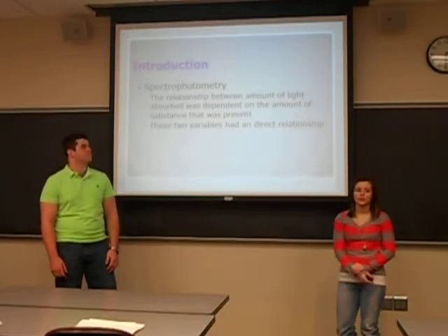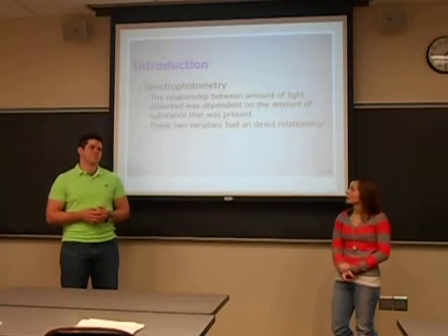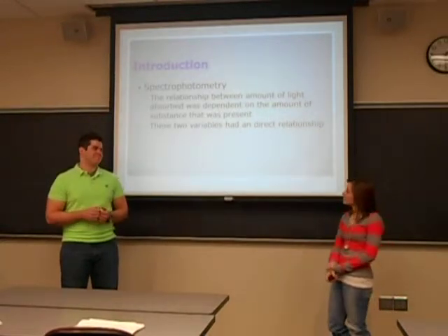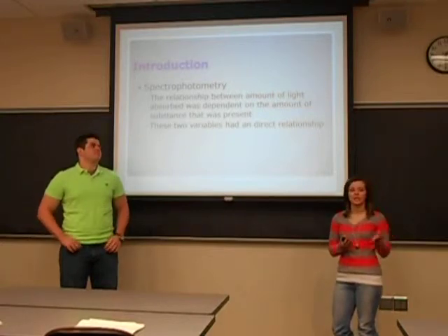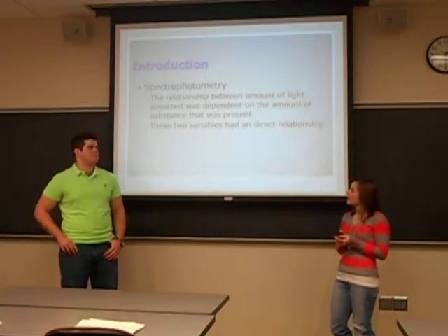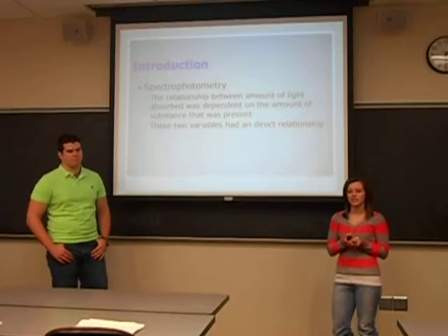A method called spectrophotometry was used in this experiment, and this simply is the relationship between the amount of light absorbed and the amount of substance present, and these two variables have a direct relationship.